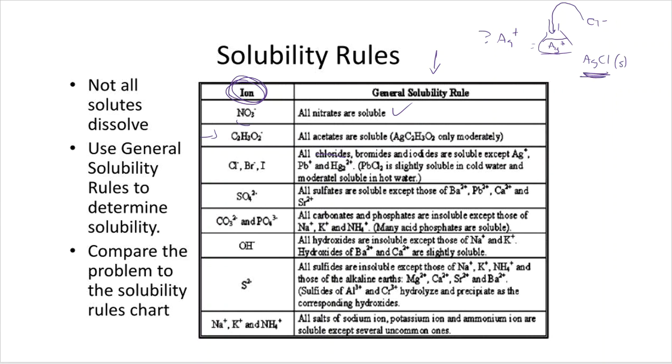Okay, now here's where gravimetric analysis comes in. Qualitative analysis would stop at this point. Did you see a precipitate? Ding! Yes. I put a check mark beside of it. That means silver is present. And then we move on to the next step. But in quantitative analysis, in gravimetric analysis, we have different versions, we have different forms, folks.